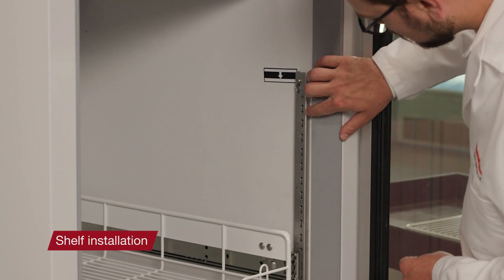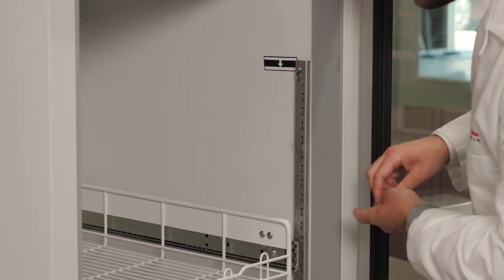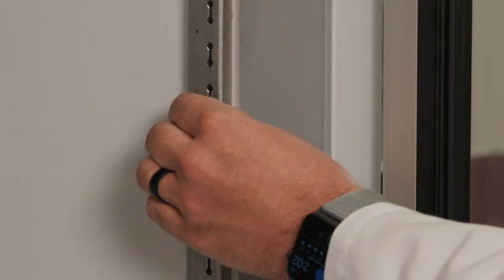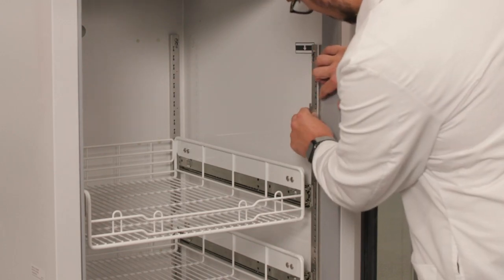Determine where the shelves should be placed and insert a shelf clip into the side bracket to mark each level. To insert, hold the clip with the retaining bar facing upward. Then insert the flanges of the clip into the appropriate holes and slide down into place.